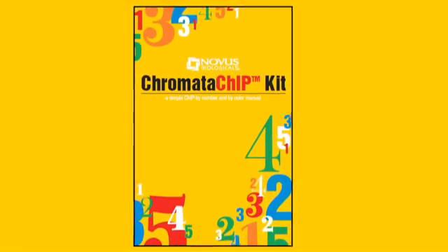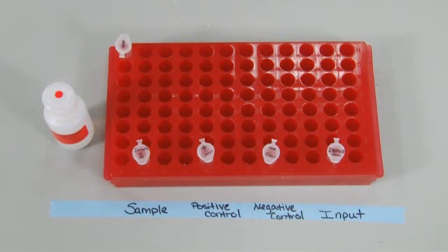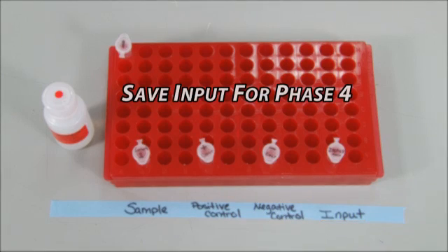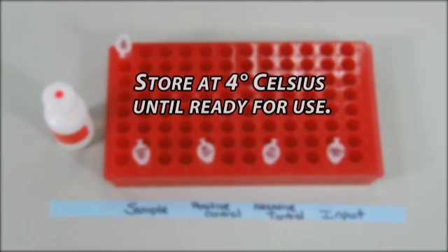If you are using the ChromatoChip kit, your kit includes a positive control antibody. Dilute one last sample and label this input. The sample will not go through the IP process and instead be saved for phase 4 of the protocol. Store this at 4 degrees Celsius until ready for use.